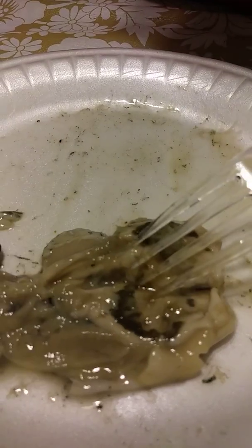we can see the mantle, the muscle that is responsible for opening and closing. So this is the top of him. This is his mouth, his stomach. This is the intestinal tract. That tube that's coming down, it's coming from the stomach here. It's a little dark in the stomach, so he's been eating a lot. The stomach area, that's the tube here coming from his mouth. So he swallows, it goes to the stomach, comes out the intestines and out of the anus.